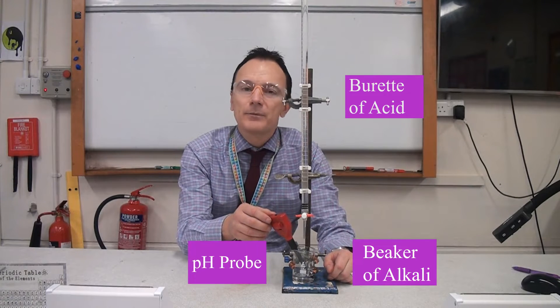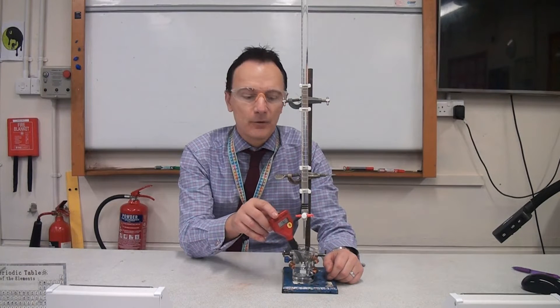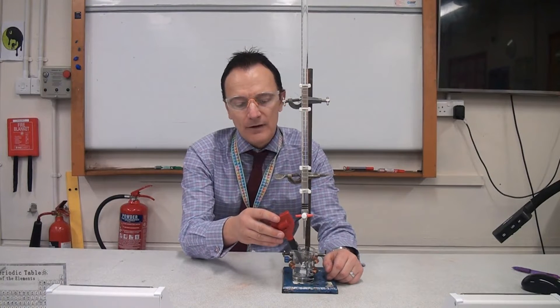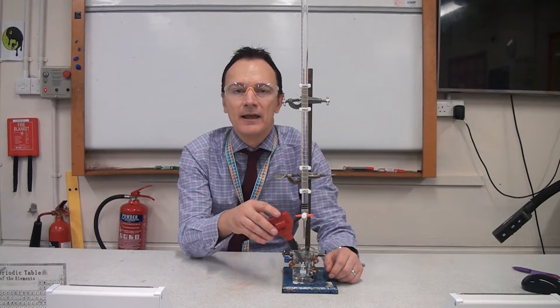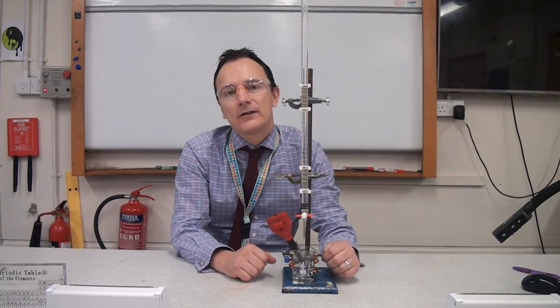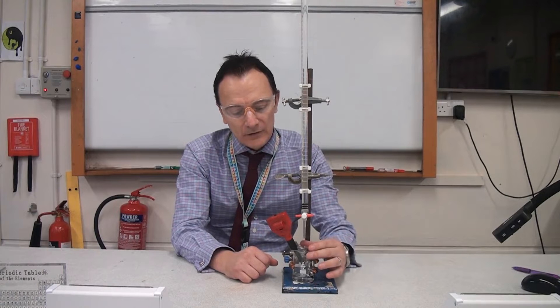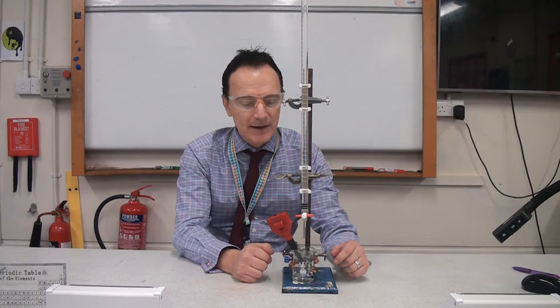Instead I've got this pH probe, which gives me a digital readout of the actual pH. At the moment it's showing a pH of 13.22. We say this has got a higher resolution — it can detect much smaller measurements. And we're going to need that because what I'm doing is checking how the pH changes during neutralisation, starting with my alkali in the beaker and gradually adding more and more acid to it.